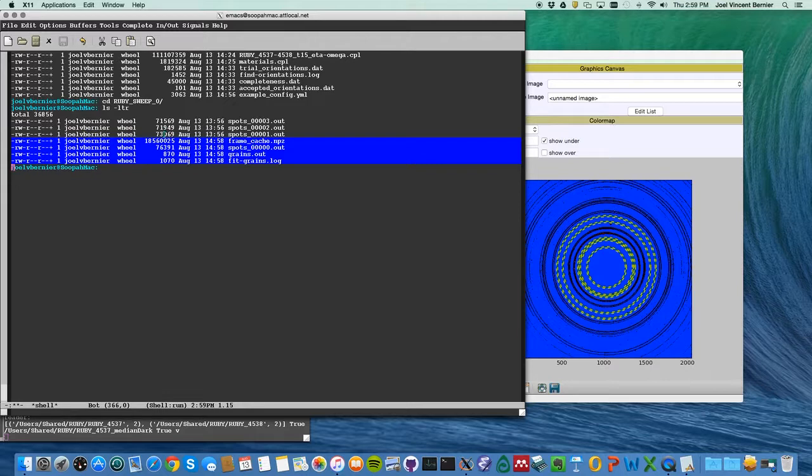So just notice this is in bytes. So I took what is about 4 gigabytes worth of data, I think, and it collapses it using a pretty low threshold to 18 megabytes. So that frame cache can get carried around. It's a good way for compressing the data. You can actually call the option to cache frames based on the config file as an option from the command line without doing the grain fits.